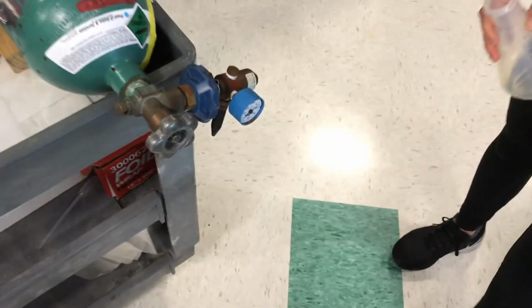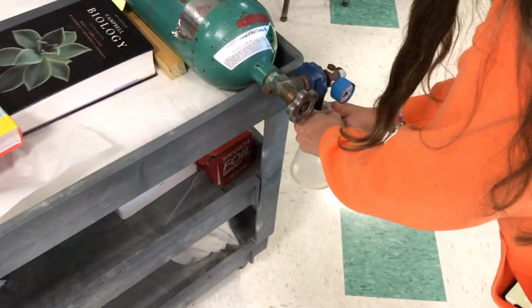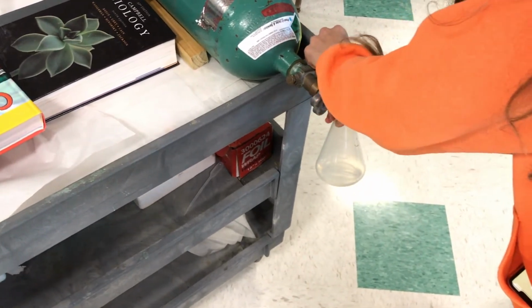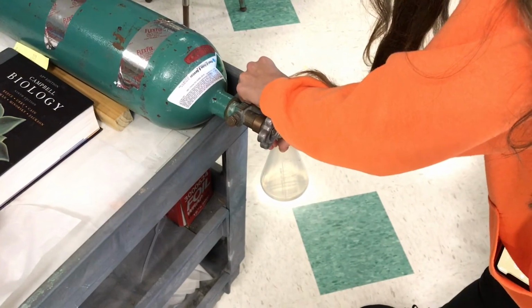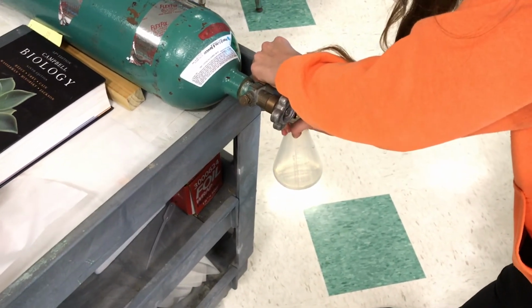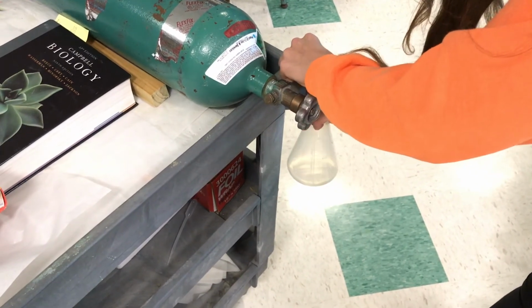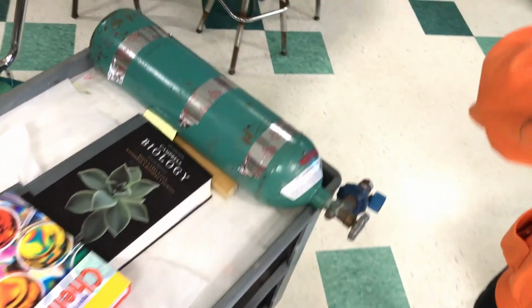Now we're going to go back to a heavier gas. Notice the balloon valve here is pointed downward because this gas is heavier than air, so it's going to fill the container the other way. Now this is argon. So this is heavier than air. So we're going to flush out the air. We've got to keep the flask this way, because if we don't, the gas will escape. That's aggressive enough. Keep the flask upright, and now put the top on nice and tight, and then we're going to mass this guy out.